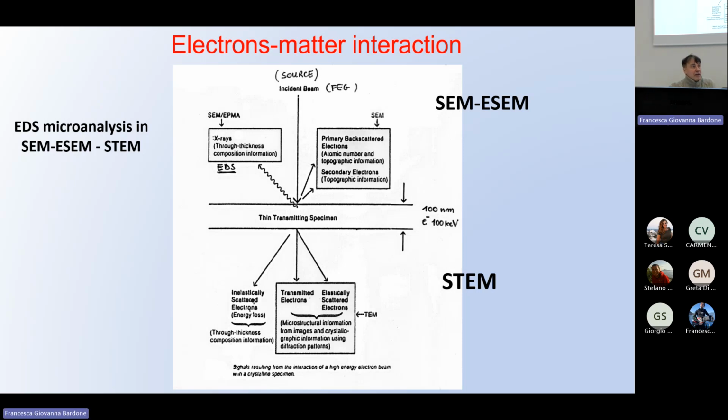So one day, if you work with a transmission electron microscope, never say never. Maybe one day you will need maximum spatial resolution, even for biocrystallography, whatever. Remember, you need to prepare a very thin specimen of your biological stuff, mineralogical stuff, whatever stuff, thin. And when I say thin, for electrons it should be less than 100 nanometers.